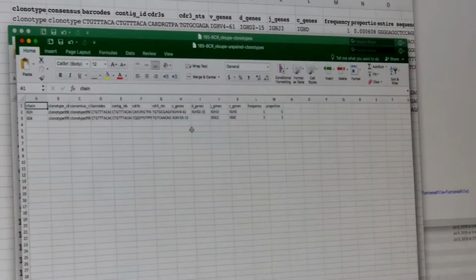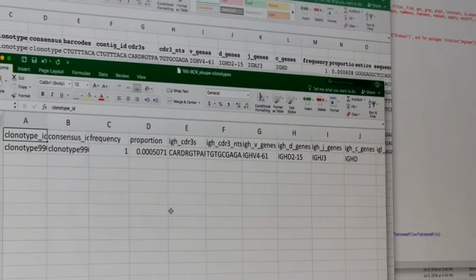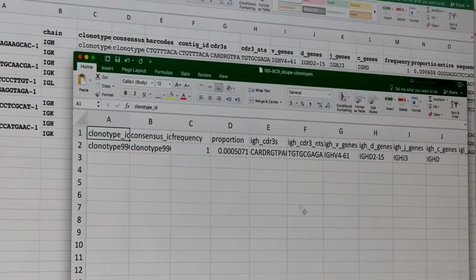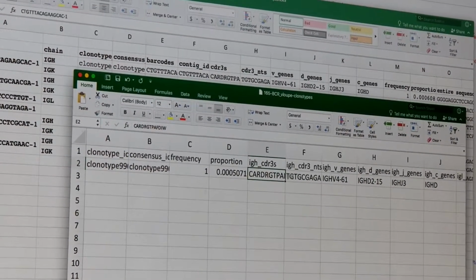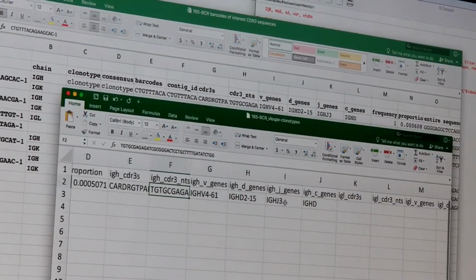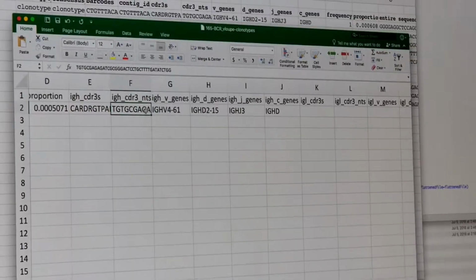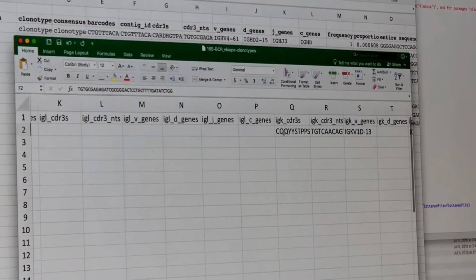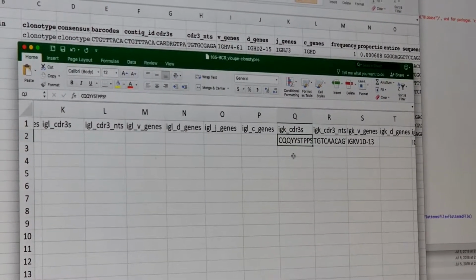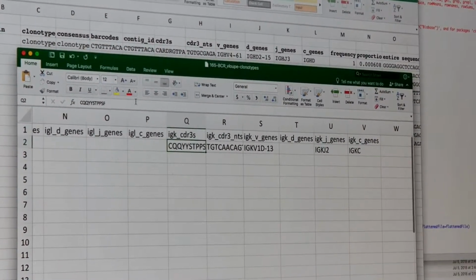But what we want to do now, what's the next step? We want to put these into his vector. We have his vectors now. So, okay. I know that here I have the amino acid sequence of the CDR3 and of the nucleotide. So you have it both protein related and your nucleotides. And then for that one, here's the kappa sequence again.